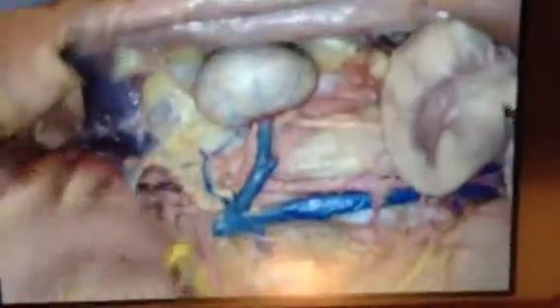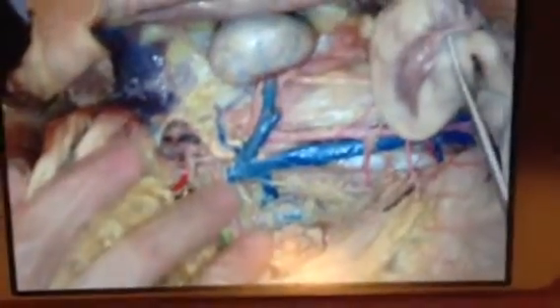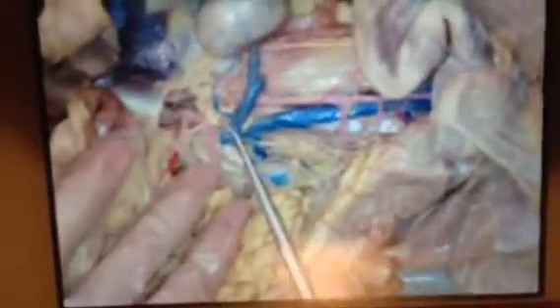And we have our right and left kidney. So that's going to be the left side. And our ureter. And what's the urinary bladder? I said that already. And then we have our adrenal gland.